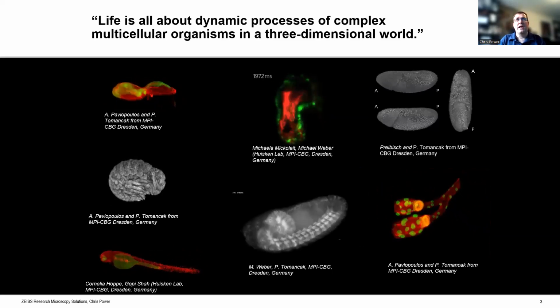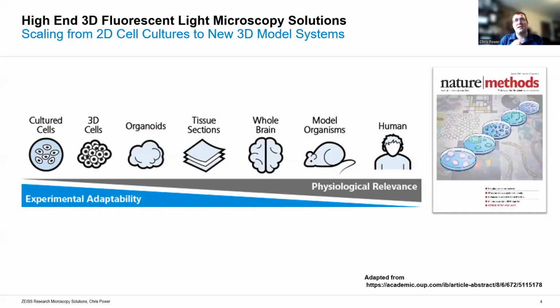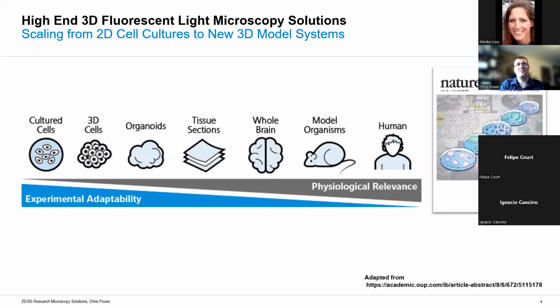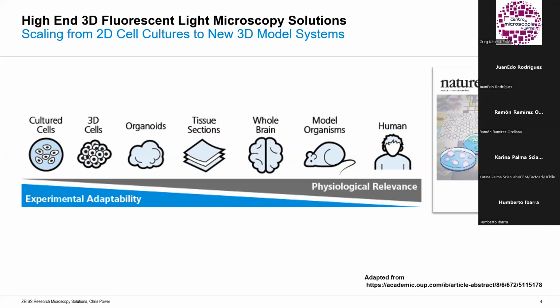here. And this you also see today in this kind of paradox discussed sometimes in things like Nature, where experimentally Petri dishes and slides are really easy, but they're not so physiologically relevant. And so what you want to do is try and think about where on the spectrum you are, and light sheet definitely helps us shift right on the spectrum.